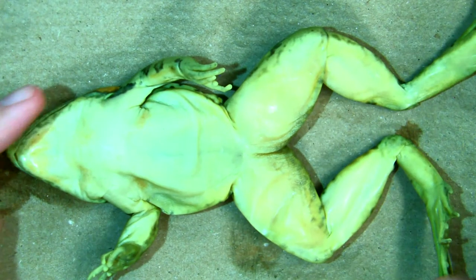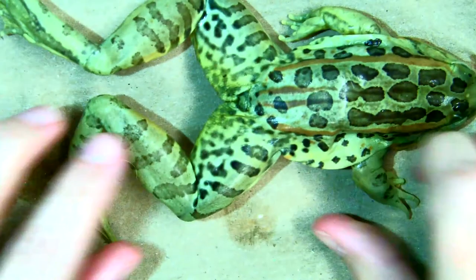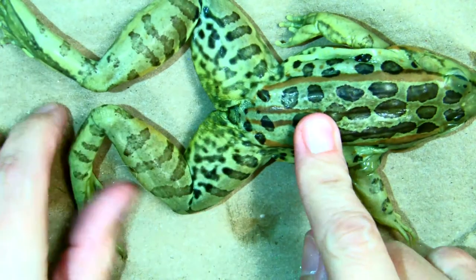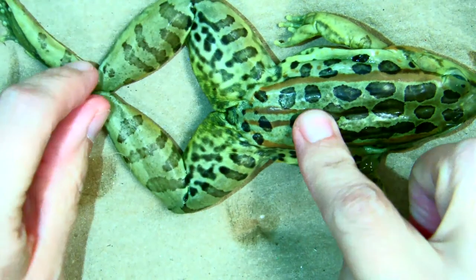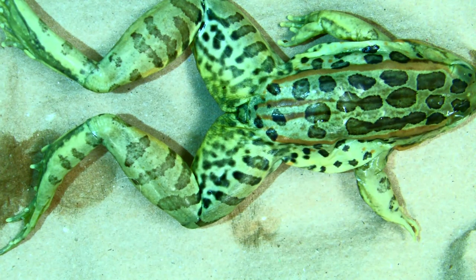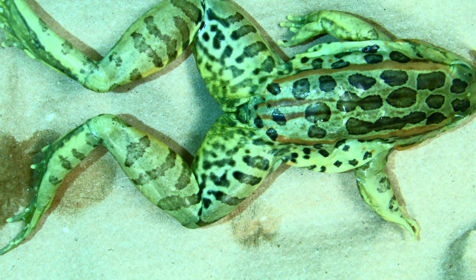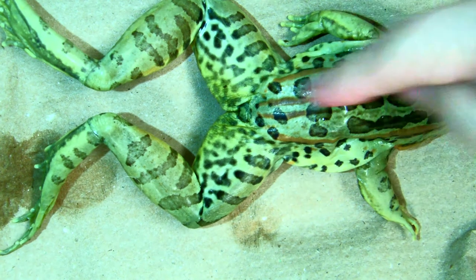You notice the ventral side is a lot lighter than the dorsal side. The dorsal side also has dark patterns on it to help them camouflage in the water. A predator from looking up, down, they can blend in.